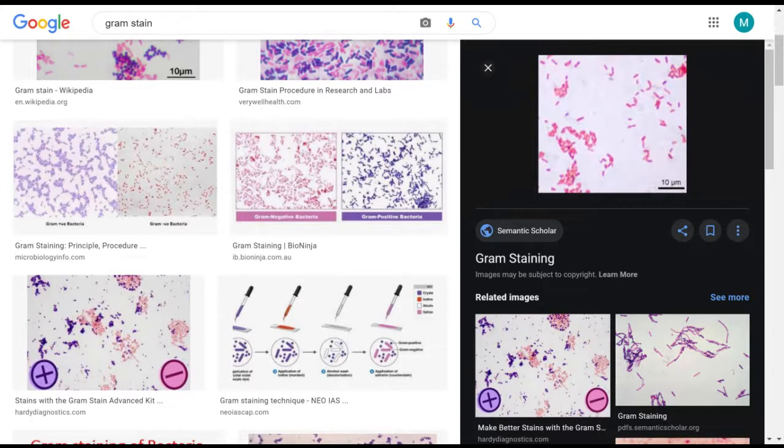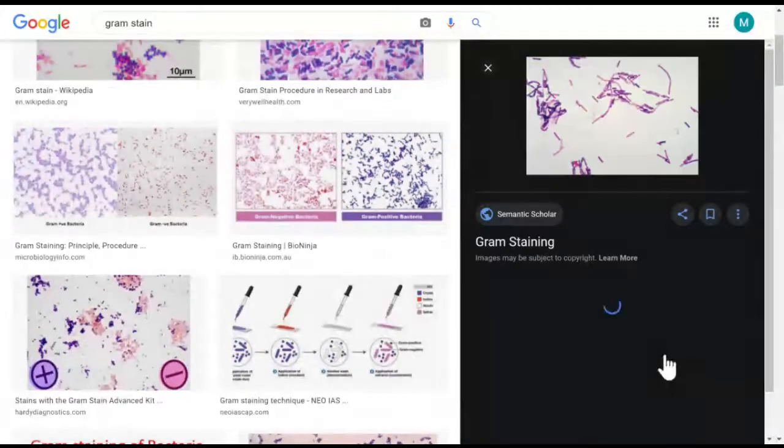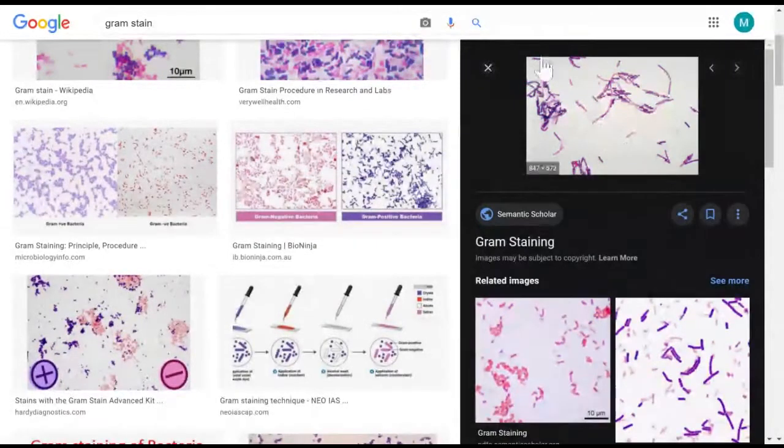Maybe in one of the labs, it looked like the same bacteria were in short chains in some areas, but in other areas it looked like clusters. So were they clusters or chains? In that case, will the answer be chains or clusters? Yeah, typically, if you see a few short chains and mostly clusters, it's clusters. When something is a chain, you're going to see chains all over. It's going to be so many chains, like this one right here. In this picture, you can look at the left-hand side and say, oh, these are clusters. But wait a minute, you have other areas where you can obviously see chains, in which case this is chains.